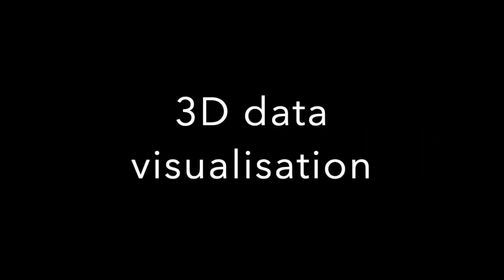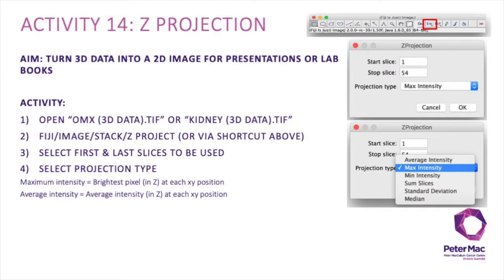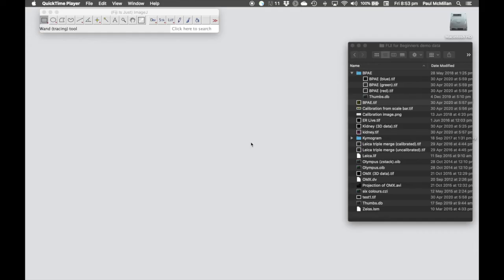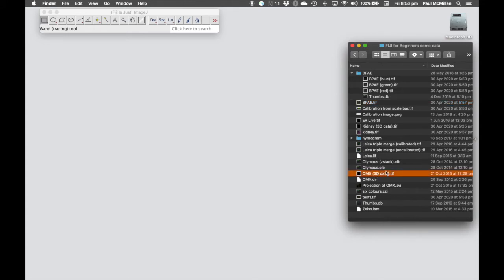Now we're going to look at how to present three-dimensional data either in a 2D format or using a movie for presentations. Activity 14 is creating a Z projection — taking all that 3D data and compressing it into a 2D image for a lab presentation or lab book. For all 3D data activities, we'll use either the omx3ddata.tif or the kidney3ddata.tif file.